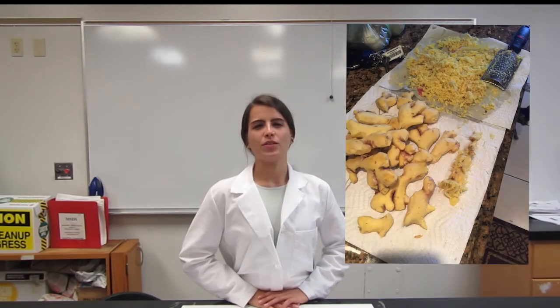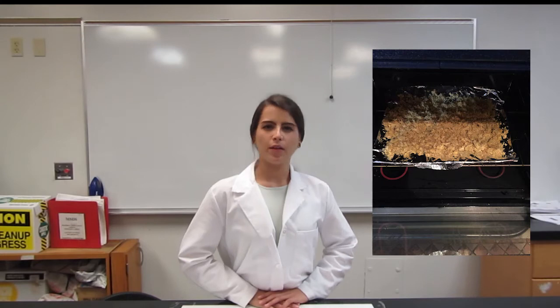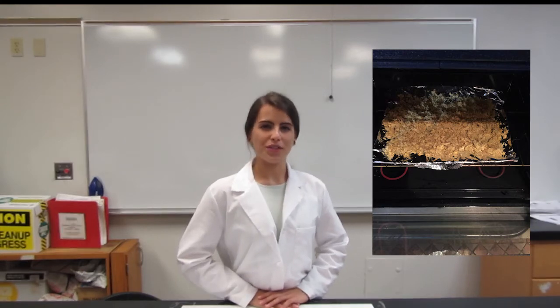nutrient agar were. In order to prepare our ginger and garlic for our concentrated nutrient agars, we took the ginger rhizomes, grated them, and laid them out in a thin layer over aluminum foil. We placed them in the oven at the lowest temperature that the oven would allow, which was 170 degrees Fahrenheit, and continued the dehydration by letting it sit in the oven at that low temperature for over 8 hours with the oven door open in order to circulate airflow.